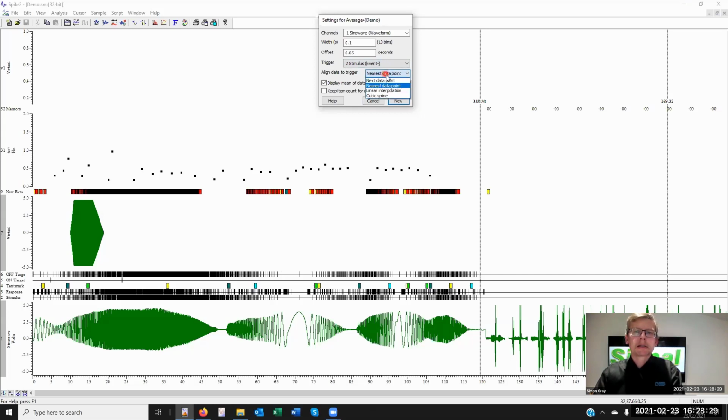Now, the next thing is aligning the data to the trigger. So we've got a separate stimulator, let's say, firing away under the control of a 1401 or independently. And because the sample data points of the waveform are not time locked to that stimulus marker, the event can occur like so, but your data points could bridge this, or they may just be in line. We just don't know what's what. So we need to do something about aligning the data.